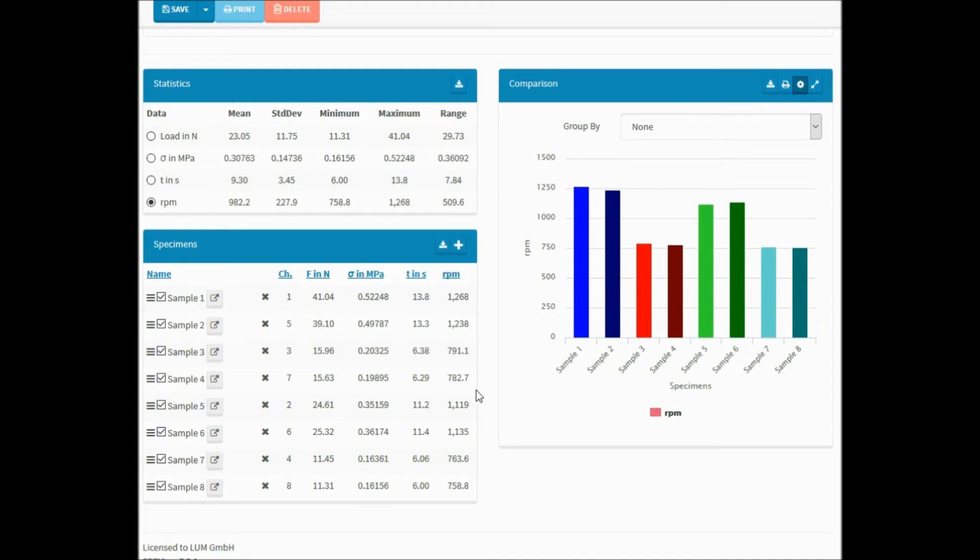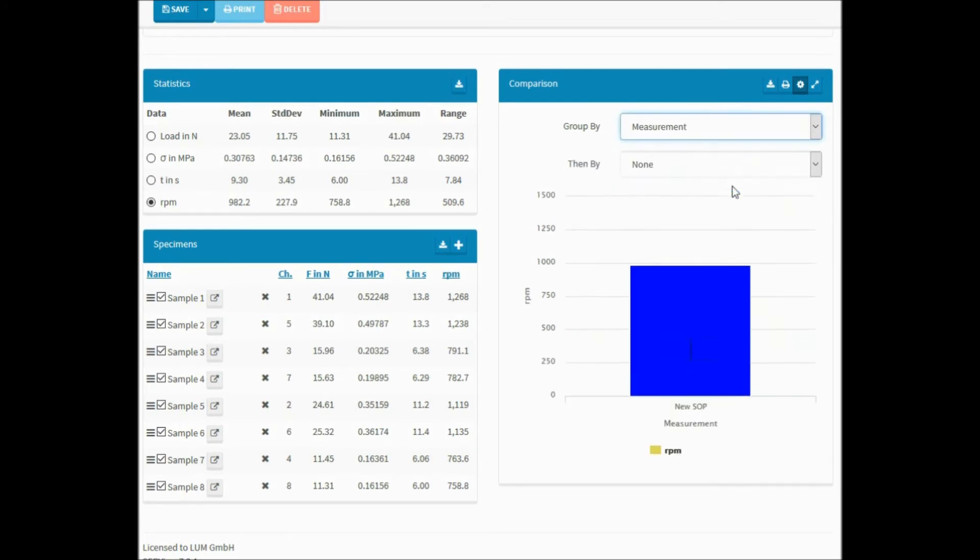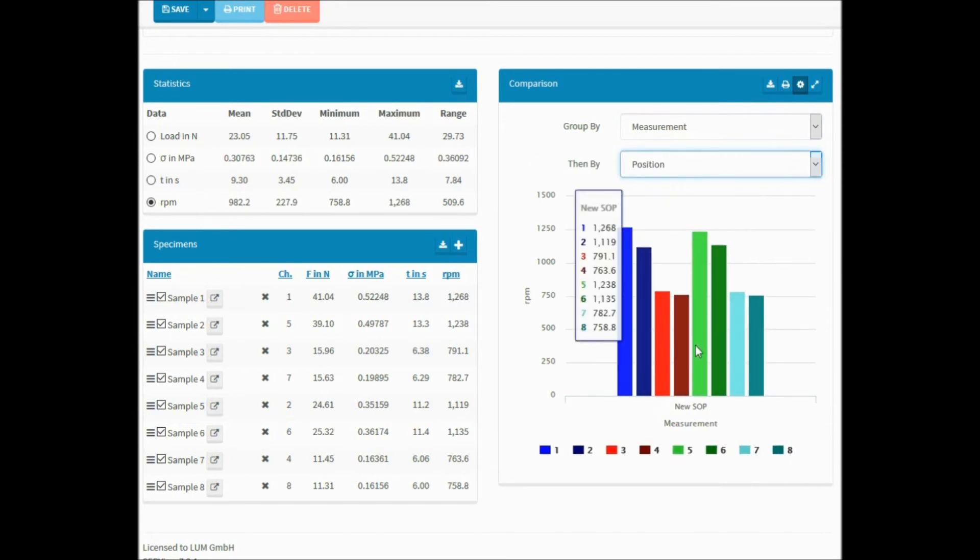The individual information for each sample is shown in the Specimens box. Samples, also from different measurements of the same project, can be added or removed from the analysis by clicking the corresponding buttons. The diagram in the Comparison box can be grouped by up to two selected characteristics, for example, measurement, adhesive, substrate etc. A manual option gives you maximum freedom to sort and arrange in your preferred way.